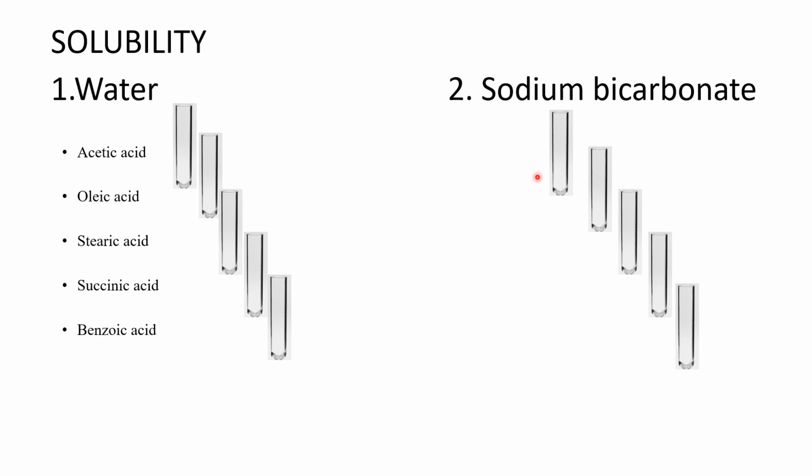But instead of water, you will be using 3 ml of 10% sodium bicarbonate solution. Take note if the sample becomes soluble or if it produces gas.